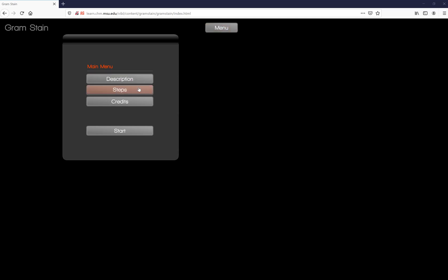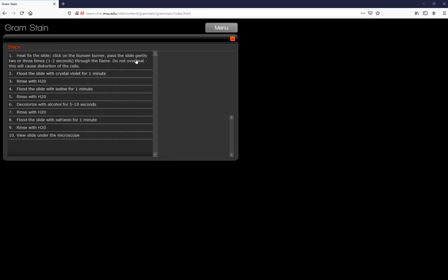Okay, again you have a menu button which will take you through the steps, so you should have already watched the narrated notes and know how to do this process.